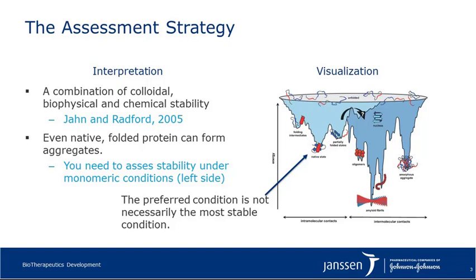And we're really interested in understanding how the conformation changes in these different areas in relation to possibly seeing something like an aggregation event, which is shown on the right side of the figure, as well as possibly are there intermediates, folding intermediates that might be leading to that state, or are we picking up changes in these partially folding states?